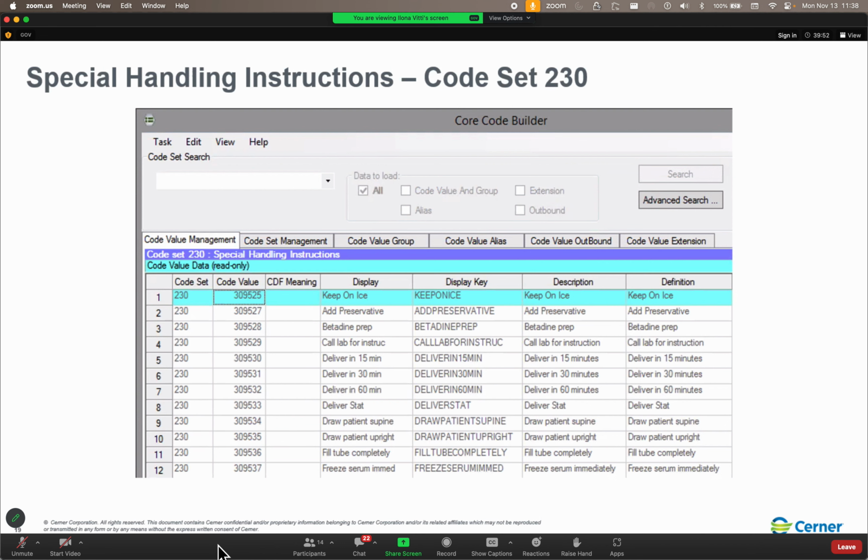So if you're going, yeah, that would be kind of silly, then you could say, hey, I only want to go maybe a year or a year and a half out. Anything past that, no, we're not going to assign it an accession, even if it doesn't land on a collection list.